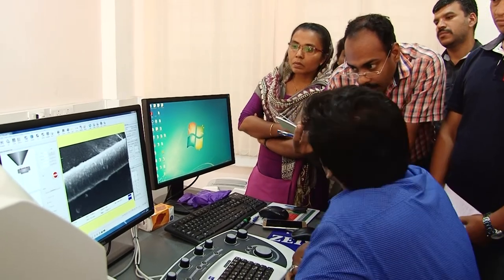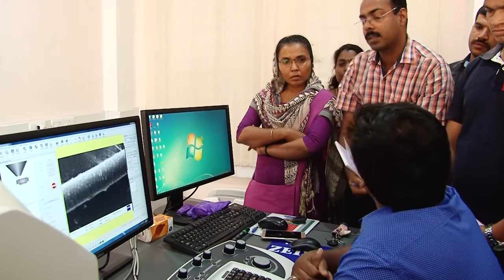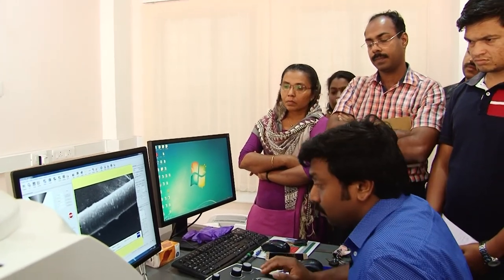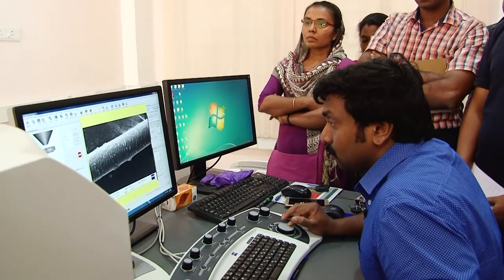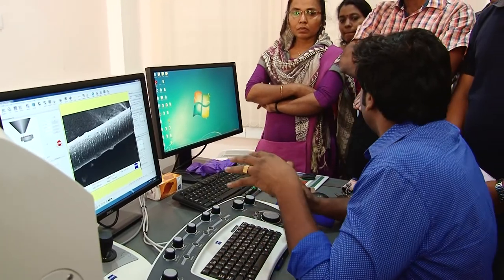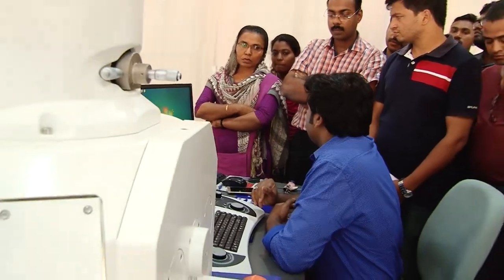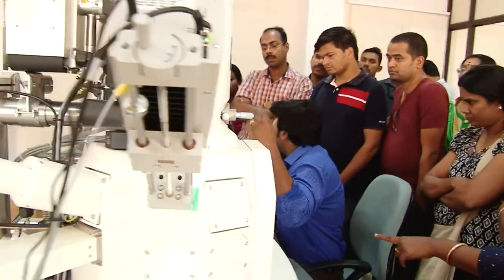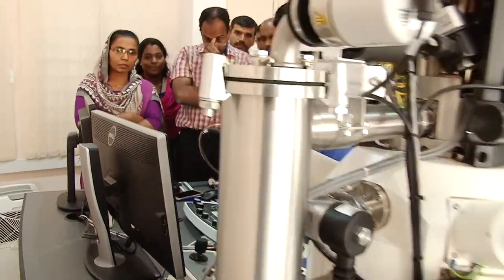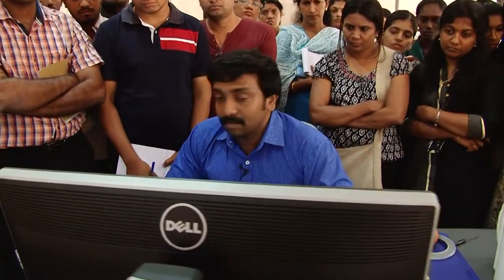The scale will be up to 1 micrometer. Nanometer scale we cannot do with this; for nanometers we should use a more efficient instrument. This is not for nanometers. Up to 50,000 x it is good. For 1 lakh and above we should go for field emission. The working principle is very much different. In this, the electron source we use is a tungsten filament; there it is different.